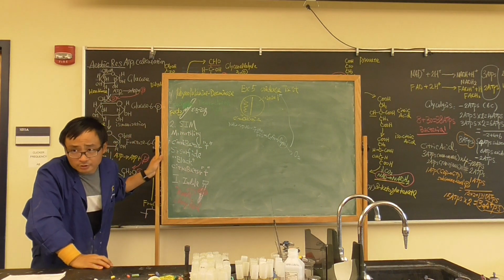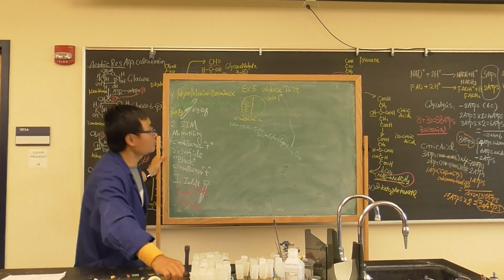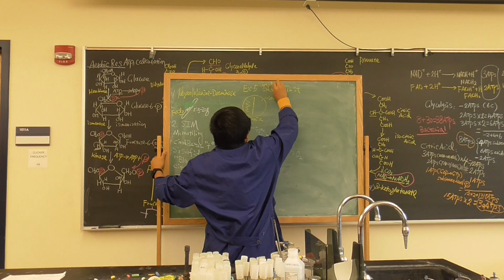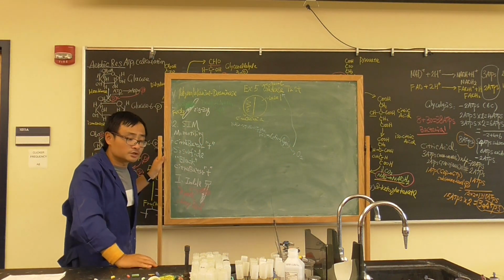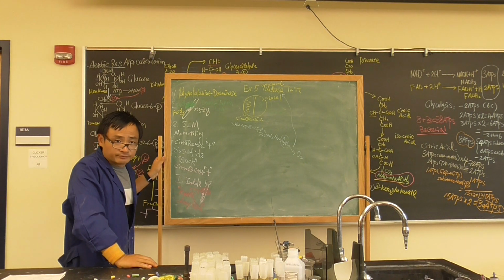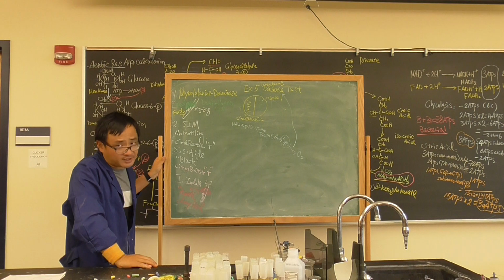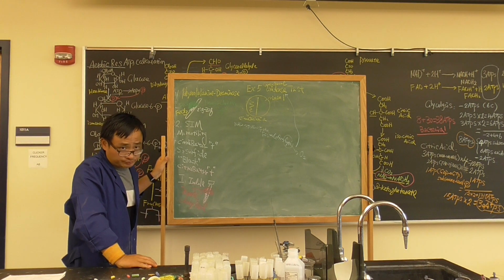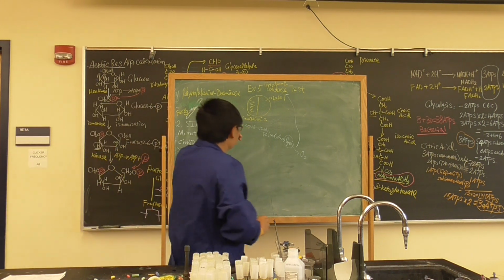Oxidase originally has a very long name; some test kits also say cytochrome C oxidase. The reason is they transfer electrons from cytochrome to oxygen. Some of the bacteria must use this enzyme. That is oxidase.